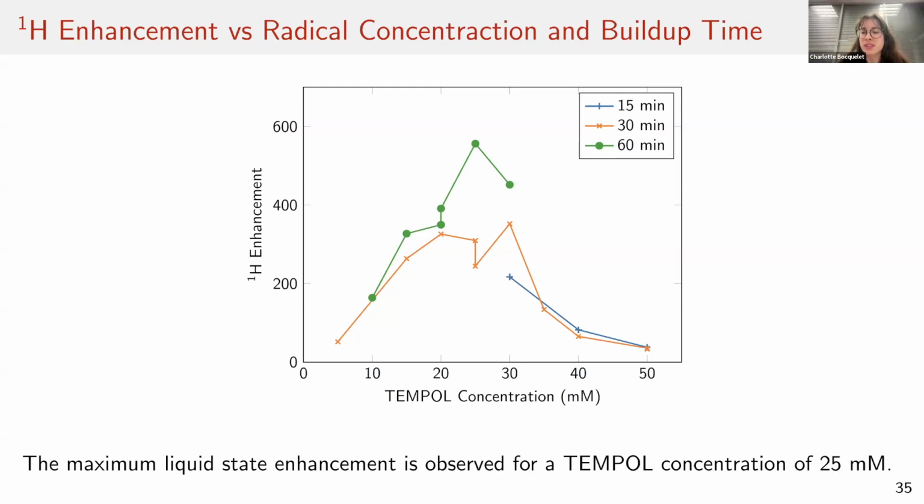One question about the robustness of the automatization of the bullet-DNP. So what is the reliability of the entire automated process, and how many runs before you require human help? Yeah, it's a bit early to say. When this machine started to work, my recollection at least is that it basically kept running for weeks. And I think we went well over 100 samples before we had to do anything. But then came the Christmas break, and we needed to restart the system, and we had a few issues then.